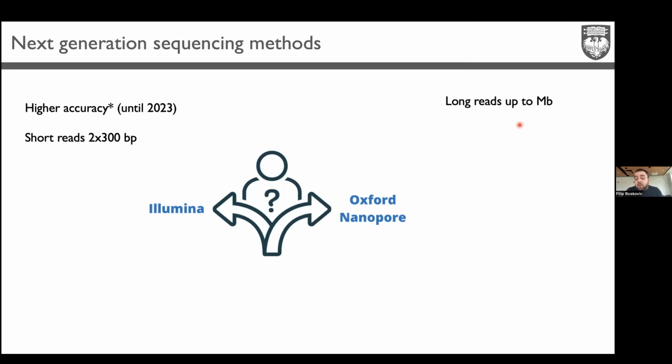Until Oxford Nanopore was introduced, we never sequenced the human genome fully, until last year. That was the first time we got the full sequence of all our DNA in the cell. That was because of the limits of Illumina. If you have 1 megabase of repeats, it's impossible to read and assemble because you don't know where they go.